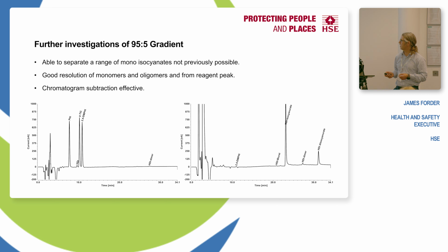Good separation, and look, nice sharp peaks. And I've subtracted away that ugly reagent peak, which improves sensitivity for the later eluting peaks.